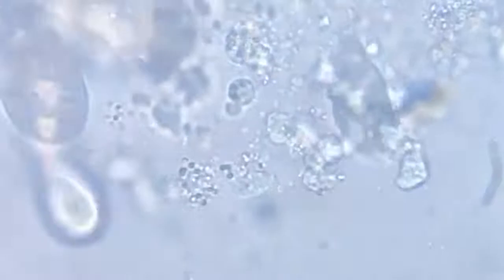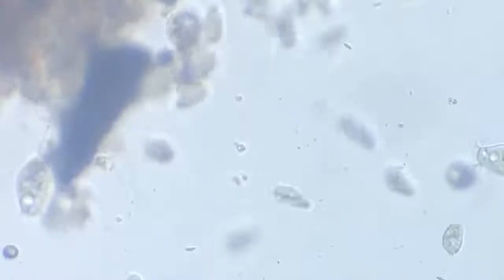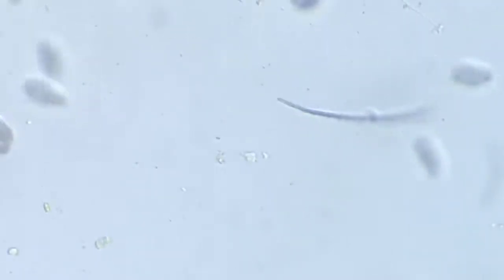Okay, so I zoom out, go to a lower magnification, and then back to some other part. There's a big amoeba here. Let's focus on him.